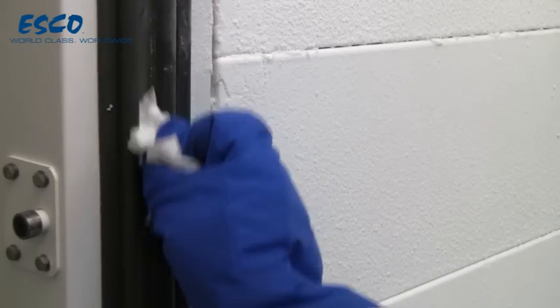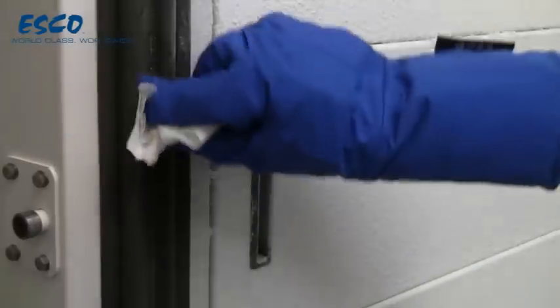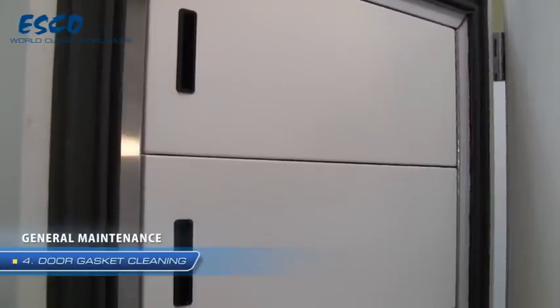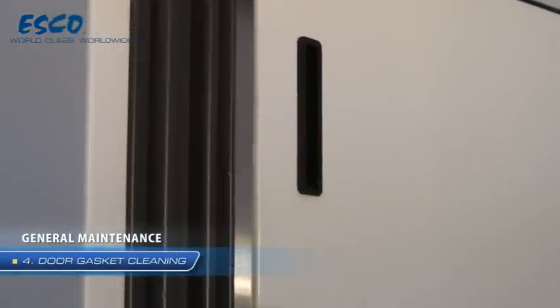Wipe off the water from the gasket before closing the door. The door gasket should be cleaned at least monthly. More frequent cleaning may be required if dirt or excessive frost buildup prevents the door from closing properly.